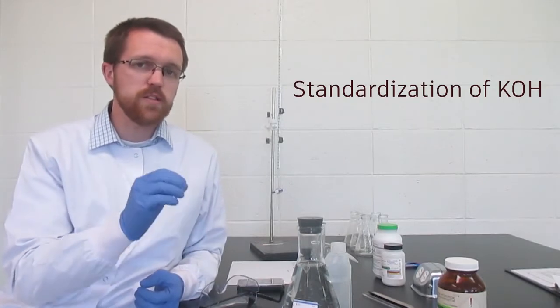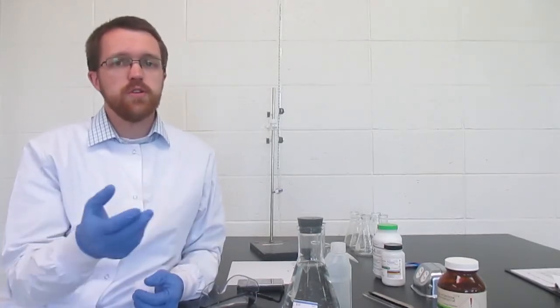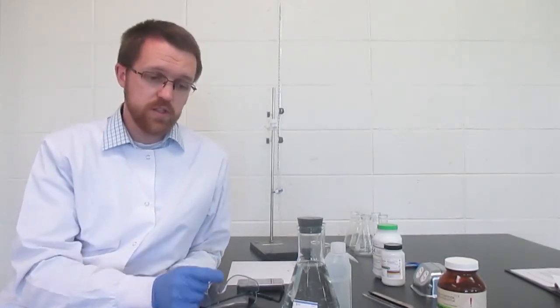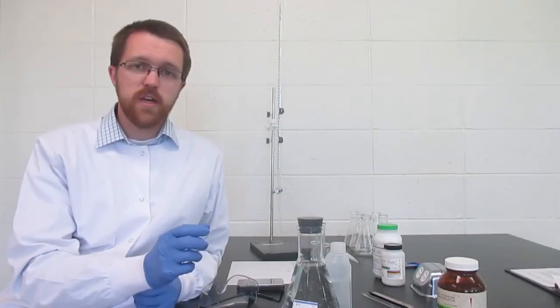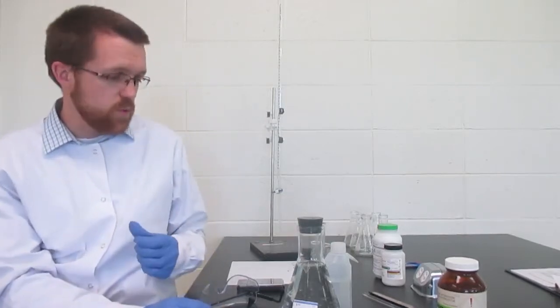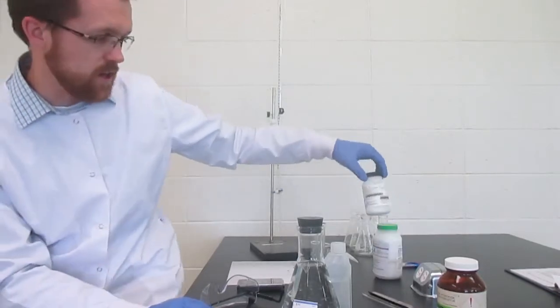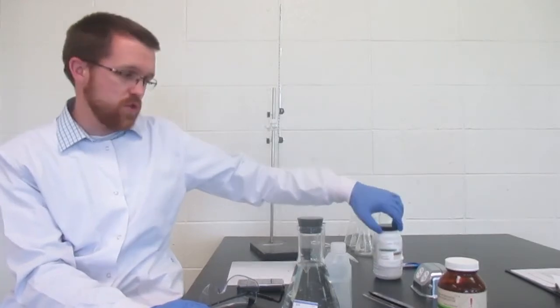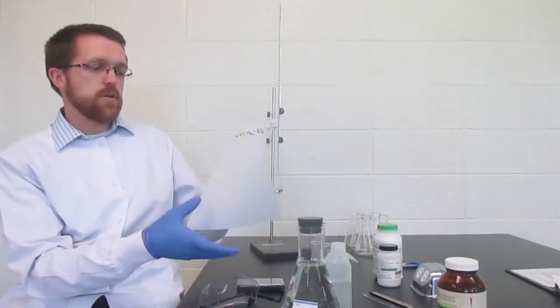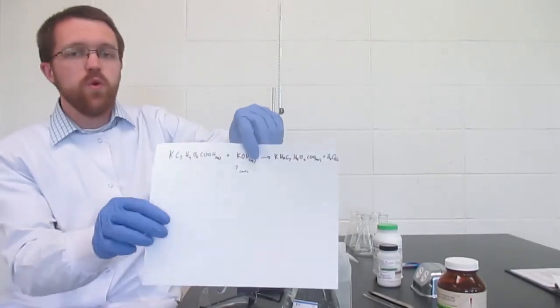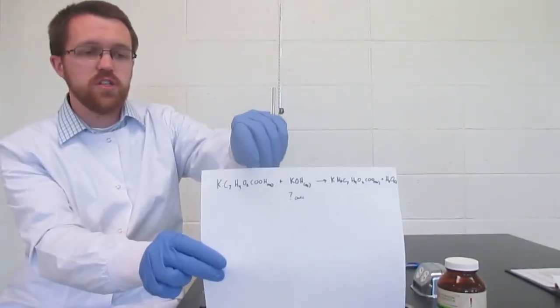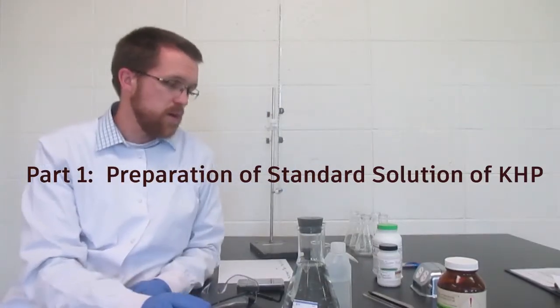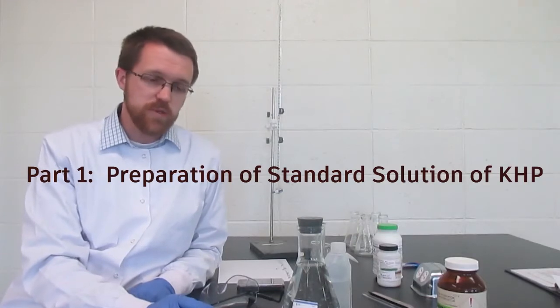In other words, we're finding out its precise concentration so that we would be able to use it in a future lab titrating with other things once we know its concentration exactly. This potassium hydroxide will react with KHP, our potassium acid phthalate. We need to know the precise concentration of this. If we look at our balanced chemical equation, we will have one unknown concentration. That means the other concentration needs to be precisely known.